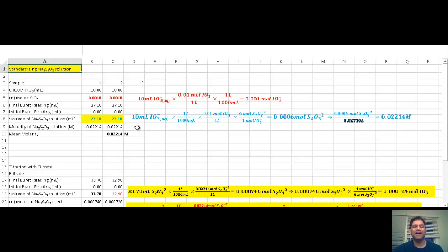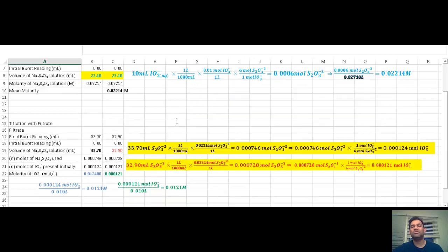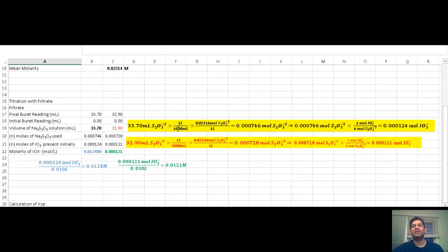Do that a second time. The results for the second trial pretty much parallel the first. If you mess up, you can do a third trial. It's important to realize that when reading the burette, you record your volume to two decimal places because the burette is meant to be read to two decimal places.